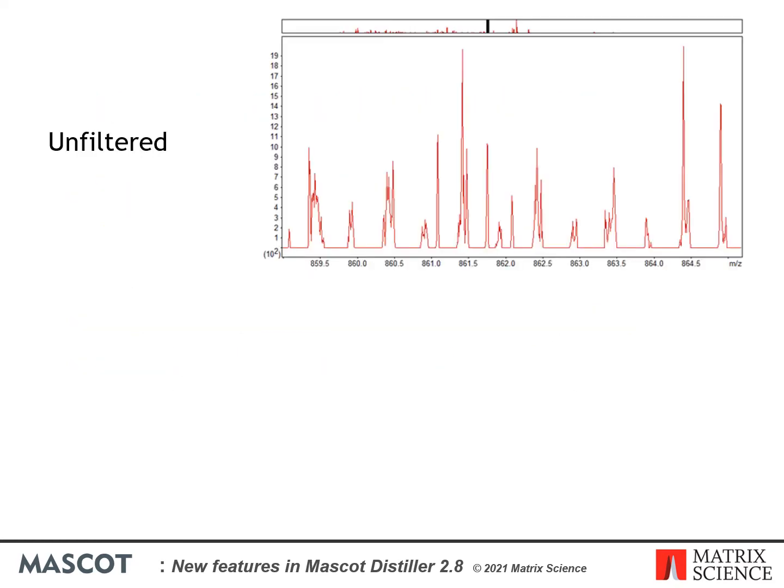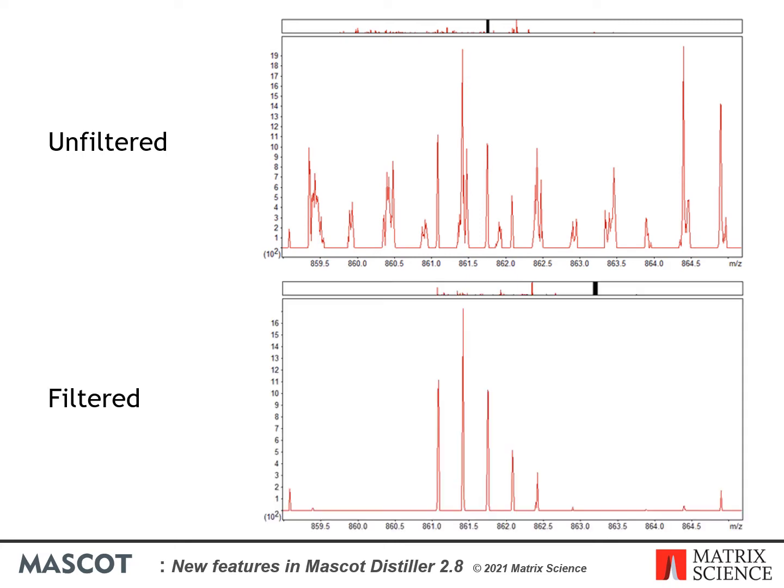Here we can see an unfiltered scan from the precursor region of a peptide. This is a low intensity precursor and as you can see there is a lot of noise and interfering signal present. With filtering enabled, the signal in the precursor area is much cleaner with very little noise and interference, despite this being a low intensity precursor.